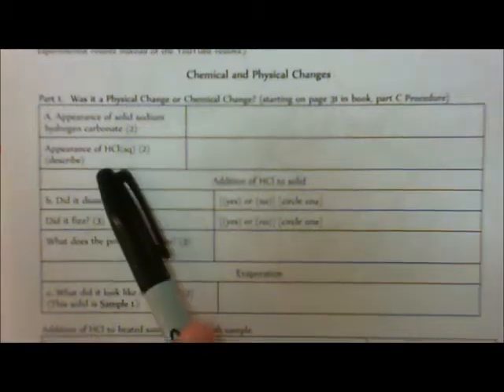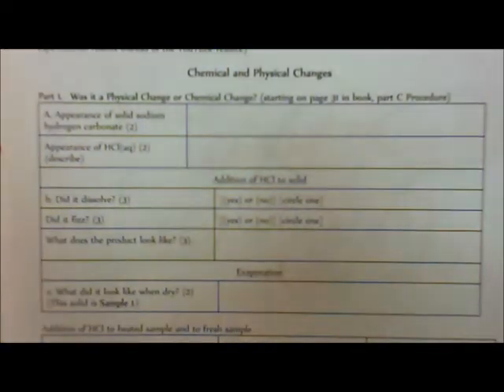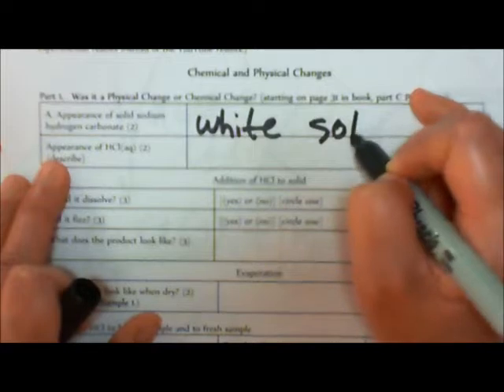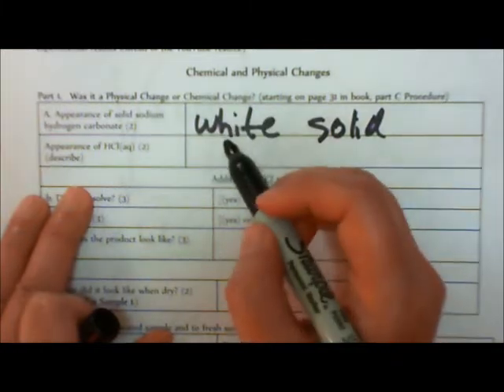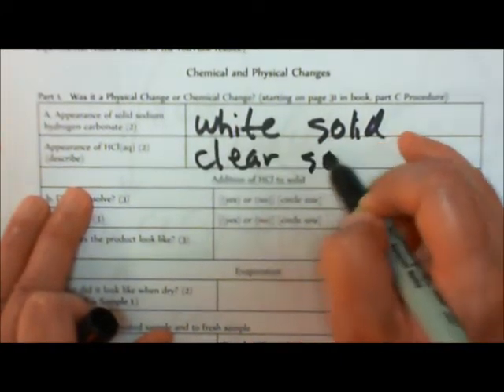Alright, so appearance of solid sodium hydrogen carbonate. I'm going to tell you what it should look like. If you went to the lab, you would see that it is a white solid. Okay, so white solid. Appearance of hydrochloric acid aqueous solution is a clear solution.